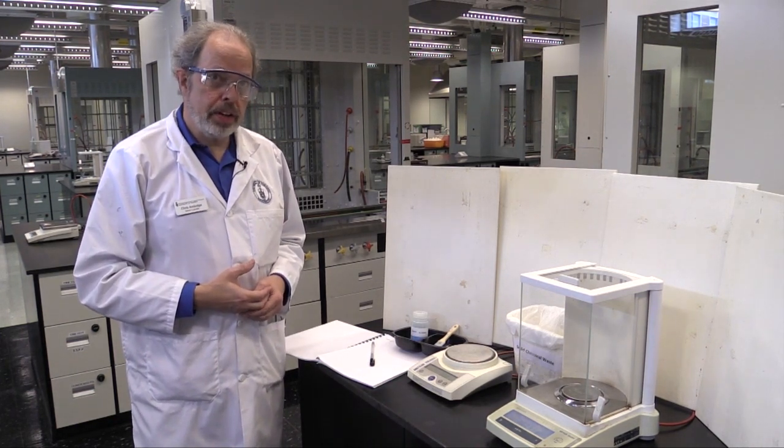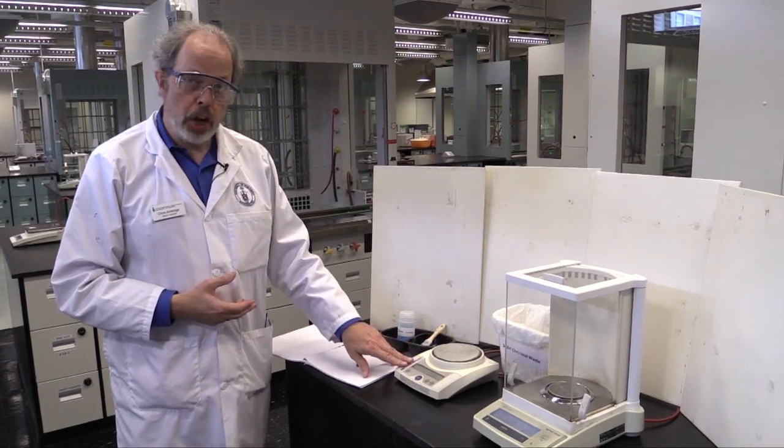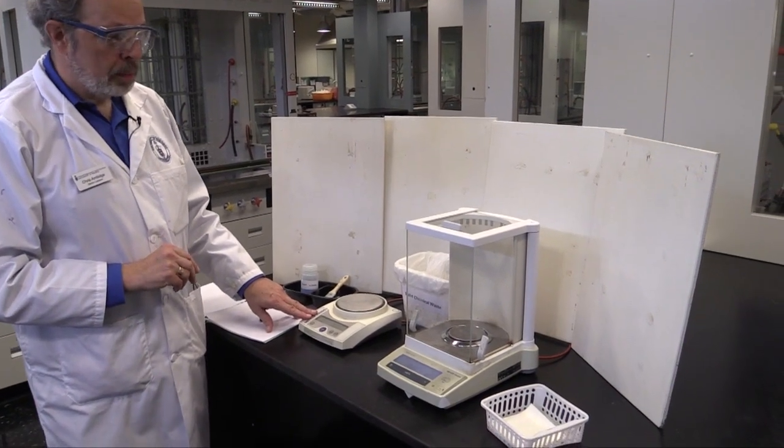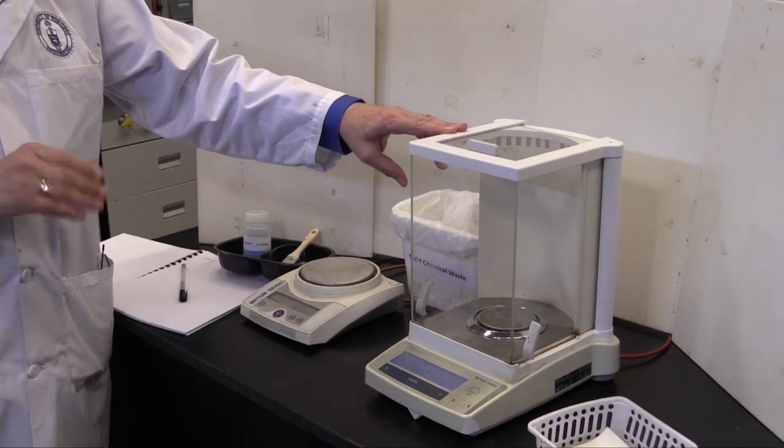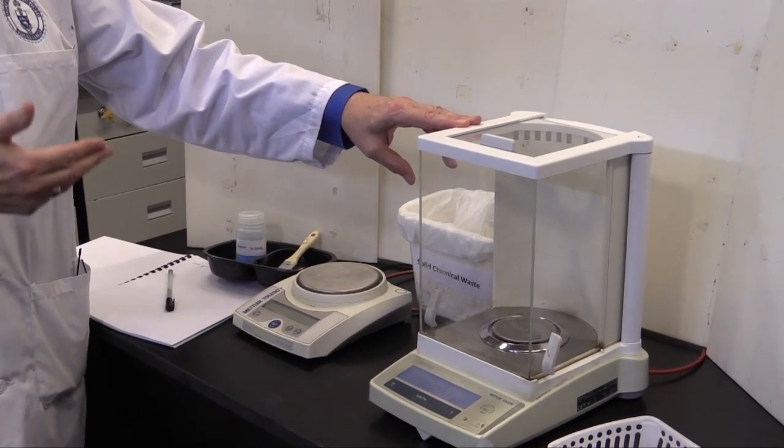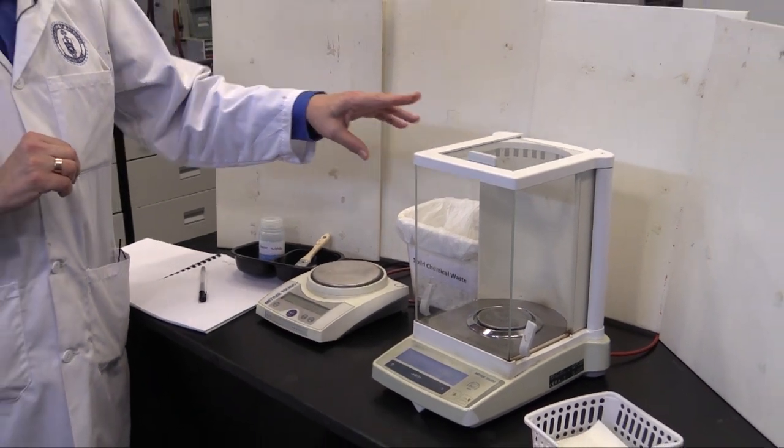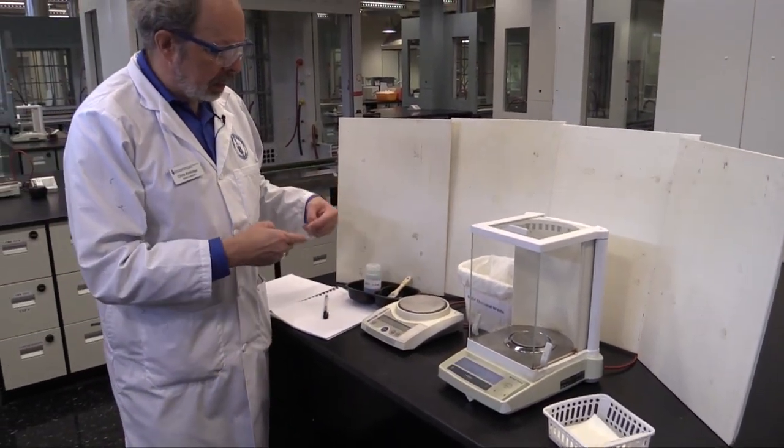There are two different kinds of balance in the laboratory. This is a top loader and it can read to two decimal places of grams. This in the glass case is an analytical balance. It's much more accurate. It can read to four decimal places of grams. We'll start off with the top loader and move on.